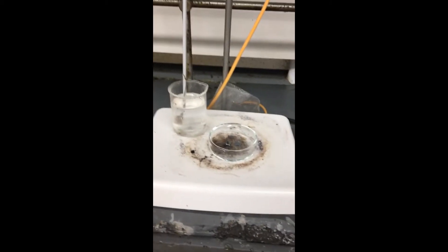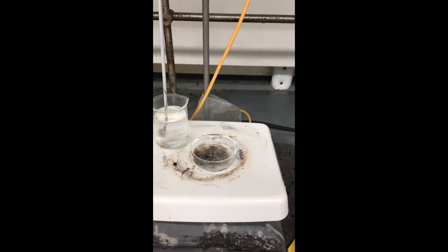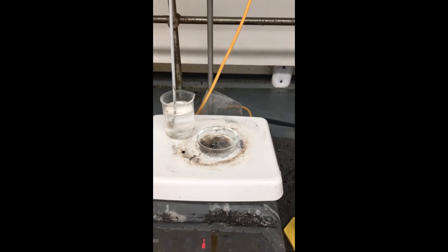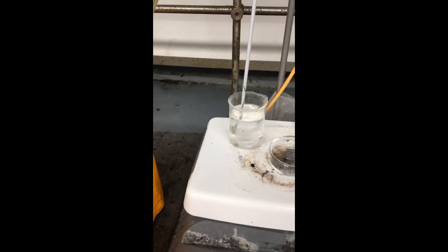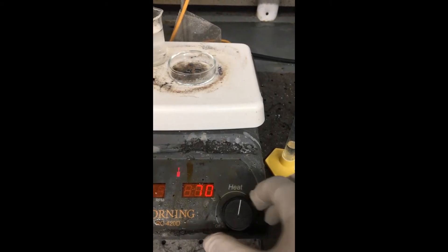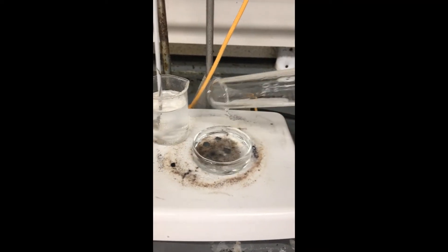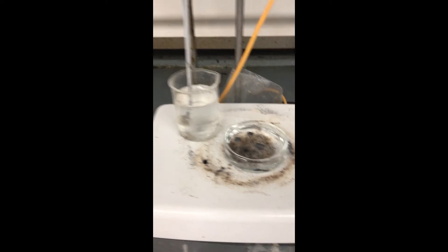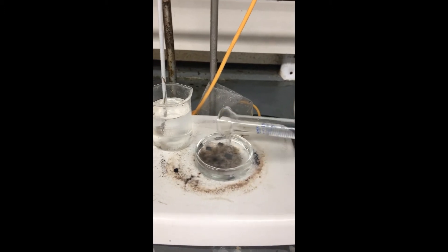In order to make a Piranha solution, it consists of 70% sulfuric acid and 30% hydrogen peroxide. First I'm going to turn up the heat to about 70. Next I'm going to take my sulfuric acid and pour it over the silicon wafers. Then I'm going to take my hydrogen peroxide and pour that in.